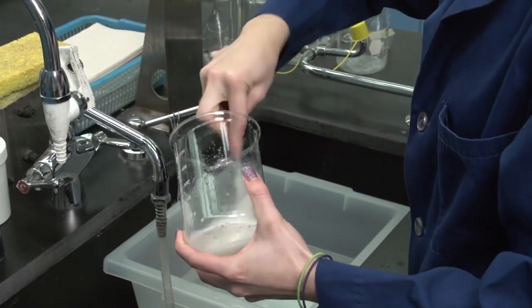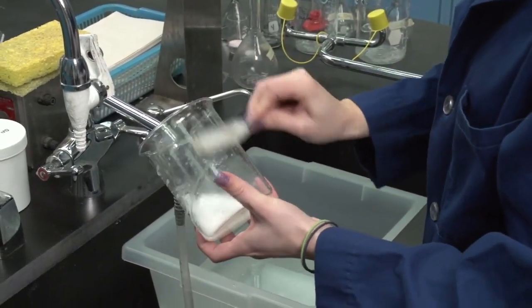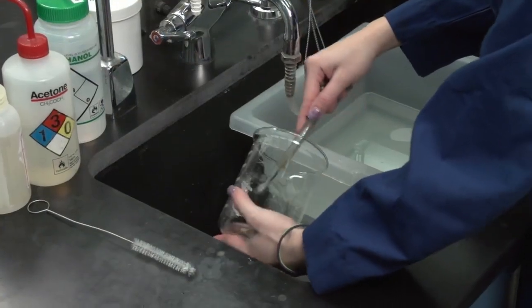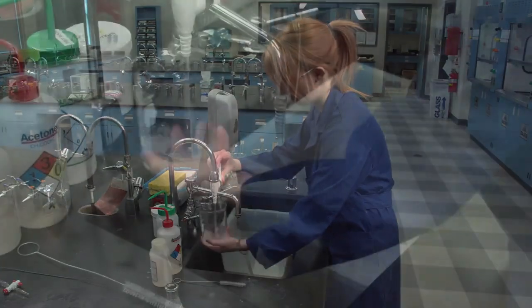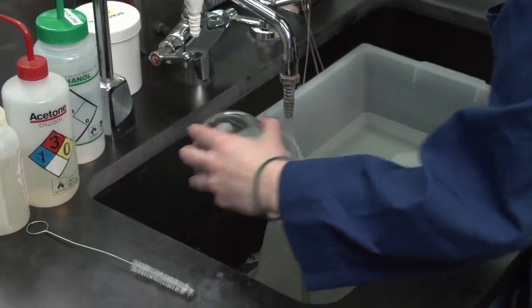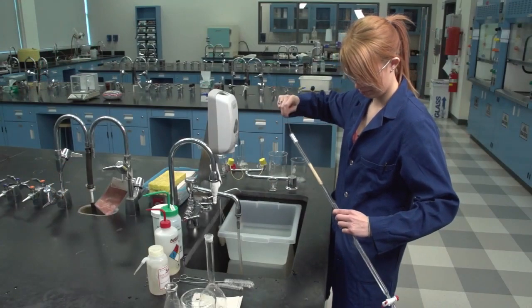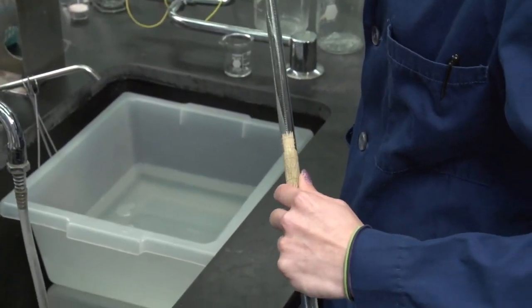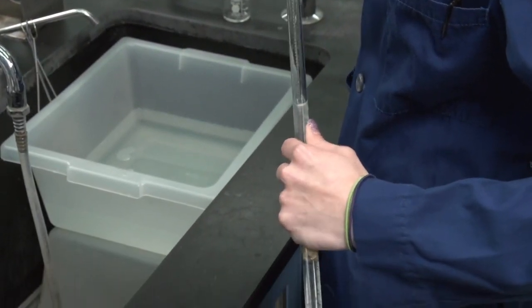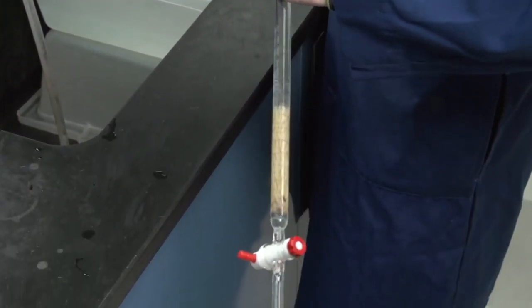General laboratory glassware should be scrubbed inside and out with the available laboratory detergent and brushes, and thoroughly rinsed with tap water to remove cleaners. Finally, glassware should be rinsed with a small amount of distilled or deionized water. Volumetric glassware such as pipettes, burettes, and volumetric flasks should not be scrubbed with ordinary brushes, as they tend to scratch the glass and can change the calibration. Special brushes are available for this purpose.